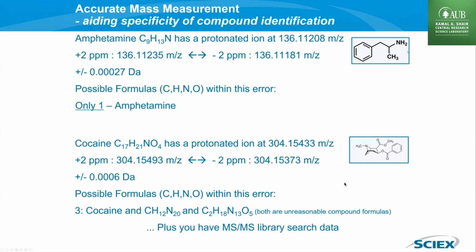And that's why it's important also to always consider the structure, right? The compound that you're building or you're finding from the data has to follow chemistry rules, right? You have to know that carbon binds 4 things. You have to know that nitrogen binds 3, that oxygen binds 2. And then you try to draw a structure with 1 carbon and 12 hydrogens and 20 nitrogens. It doesn't make sense. So you're using all of this information in order to interpret the data. Plus, you have also MSMS again, which we didn't talk about yet, but we will talk about soon.